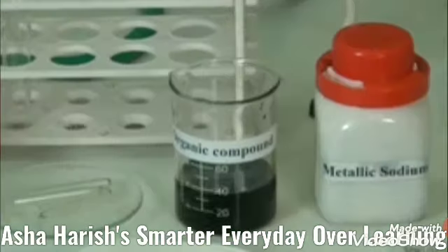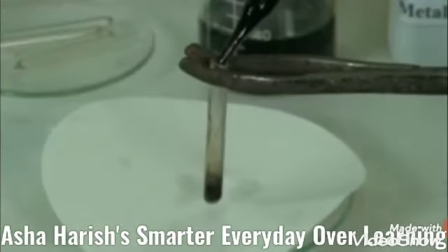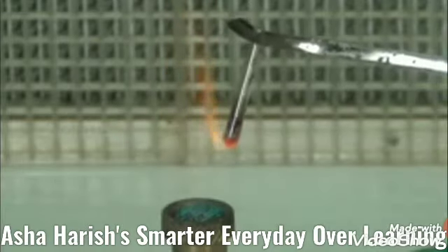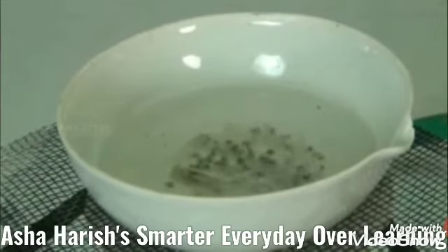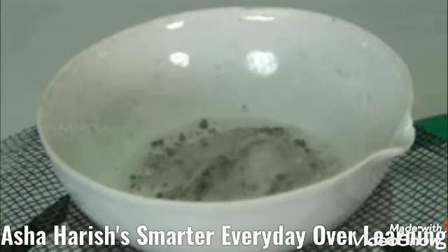Then students, what will happen? It is gently heated. Then a small pinch, nearly 50 to 60 milligrams, of organic compound is added to that fusion tube and heated strongly till it becomes red hot, just 2 to 3 minutes. Then the hot tube is plunged into a china dish containing 10 to 15 ml of distilled water. Then the contents of this china dish are boiled for a few minutes. Then after that, cooled and then filtered.